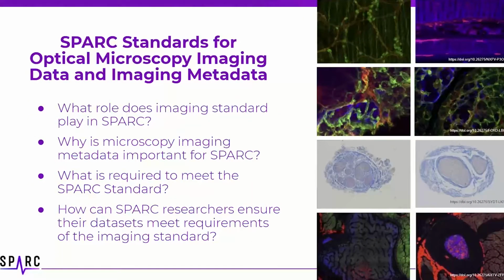We come with exciting news today. The SPARC standards for optical microscopy image data and imaging metadata were recently approved and endorsed by the SPARC Data Standards Committee. Hey Macy, what role does an image standard play in SPARC?